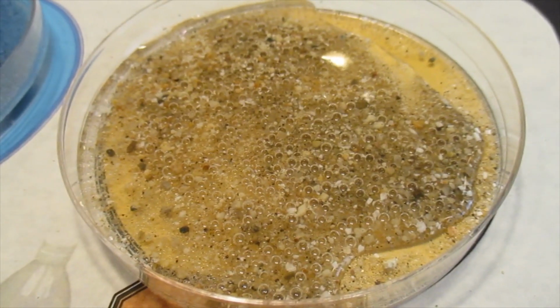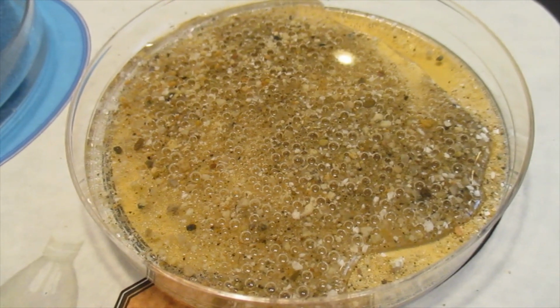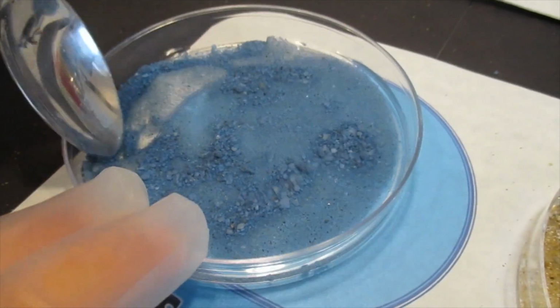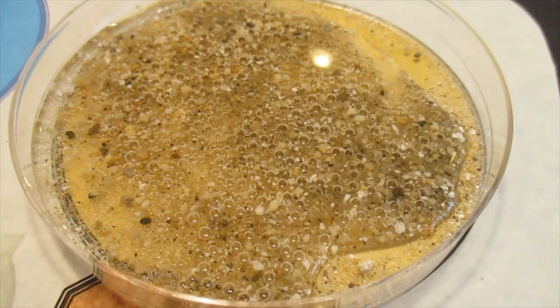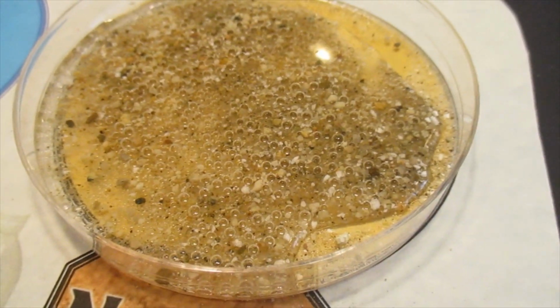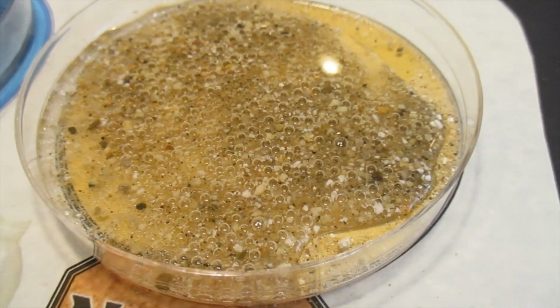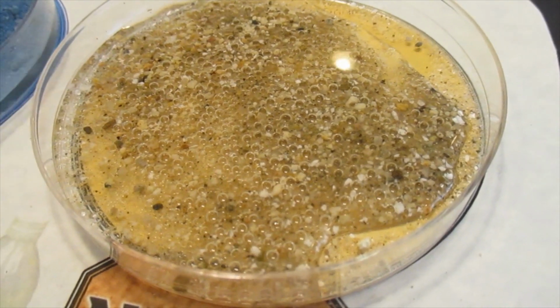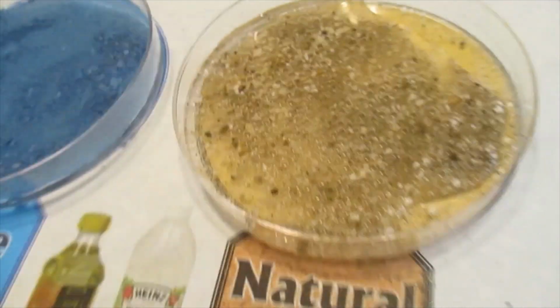Is that supposed to be bubbles in here? Well, when you do an experiment, you look and see what happens. So, do you think there are bubbles in there? There's none. Okay, so you just observe what happens. This one's got quite a lot. So that indicates the presence of calcium carbonate. And I'll bring over a rock that shows what that looks like in a moment. Okay, so that's that experiment.